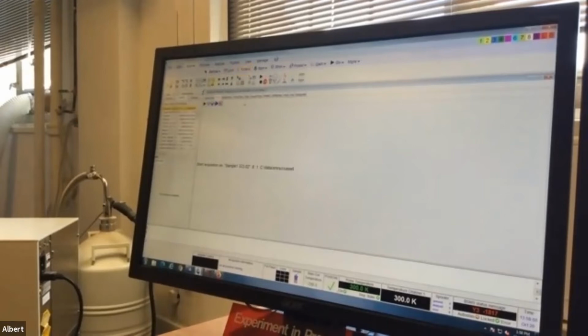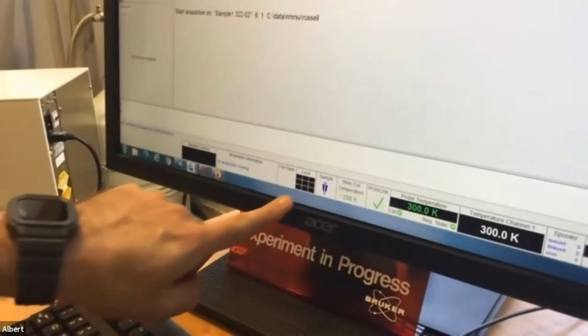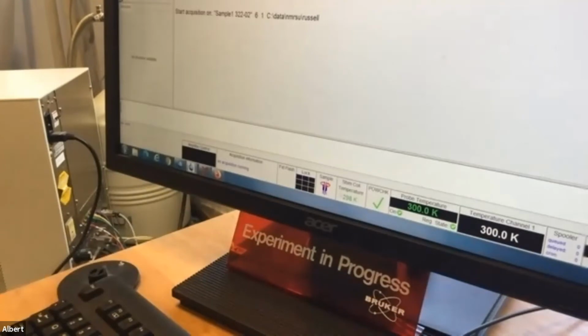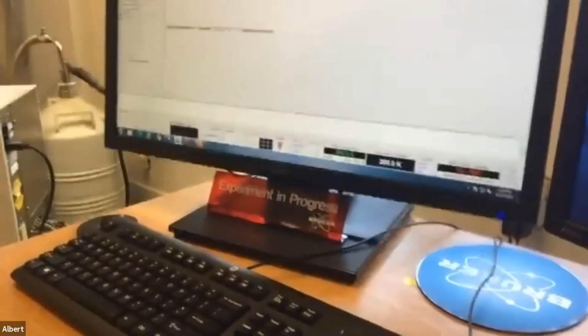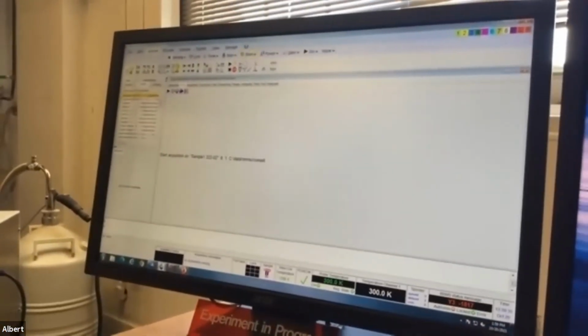And click spin. Just click it. Yep. And RO on, very top command, this one right here. Now what you're going to see down here at the bottom is a red arrow come around where it says sample. That's how you know it's spinning. Once you see that, you know that the sample is spinning. Look down in the bottom left corner, it says done. So now click post all, CHEM, and then leave it.